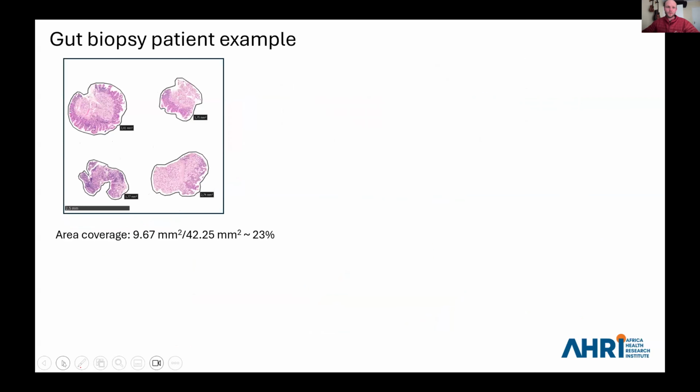And then I did want to show, this is for the gut biopsy sample. The beauty here is that you can include four different, well, in this case, four different PIDs. Because the gut biopsy pinches are so small, you obviously don't want to waste the Visium capture slide on just a single gut biopsy, so we include them into these tissue microarrays. And you can buy molds to prepare your wax blocks for this. And then you just use biopsy punches to punch out your samples from the initial wax block to then prepare this tissue microarray.